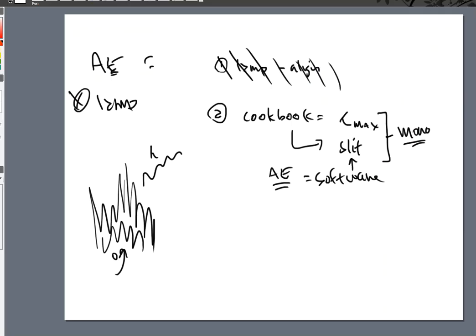All right. Okay, so now that we have this thing set for atomic emission, what's going to happen is that we will tune the machine, and I use that term very freely because tuning is really in reference to another instrument called a mass spectrometer, but we are somewhat tuning it for sodium.